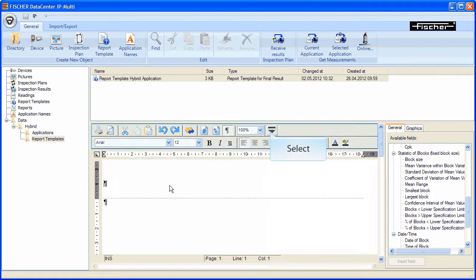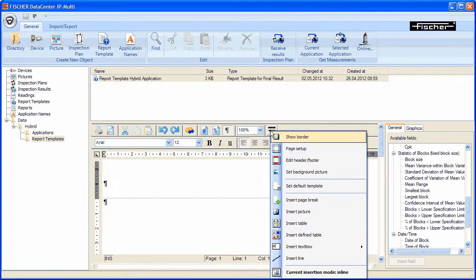Then click again on additional commands. Select the option Insert picture.